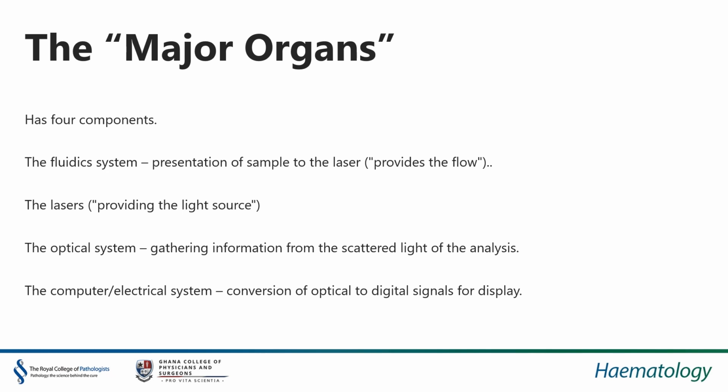The signals received by the detectors are then converted into numerical values by the electronic system. These results can then be displayed on a screen or saved for future analysis using specifically designed software. As each cell moves through the beam, its parameters, or its characteristics, are measured and recorded along with the time that it passes through the beam.